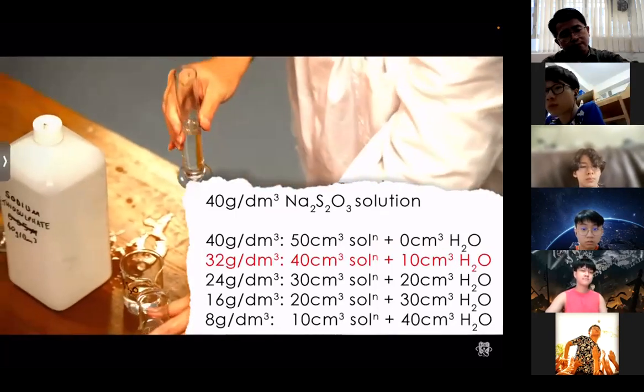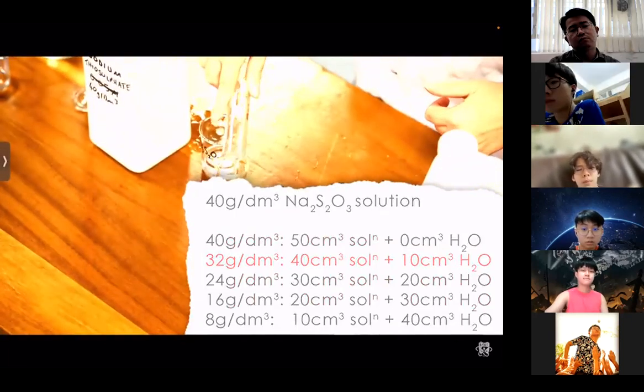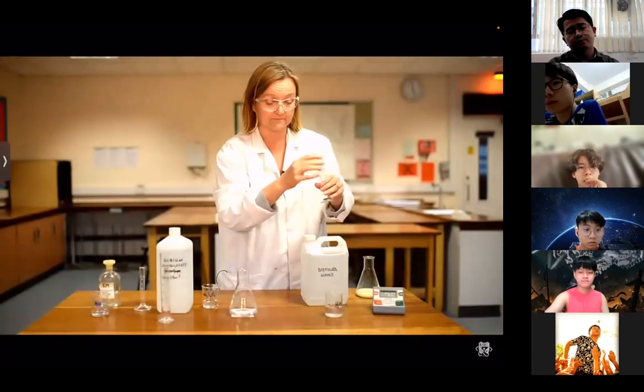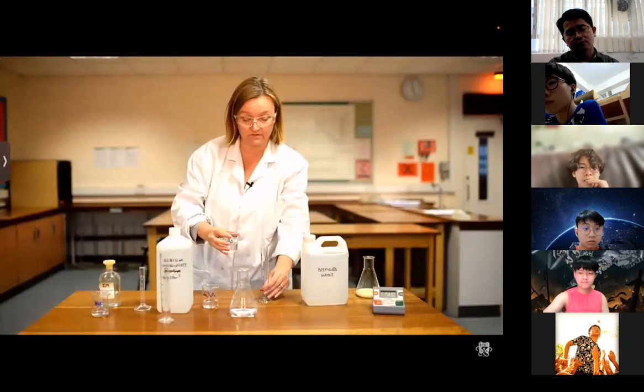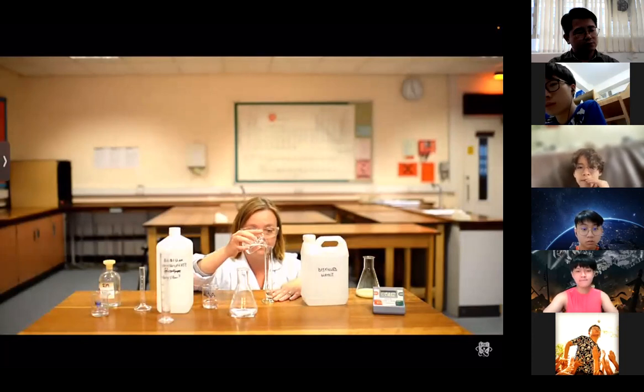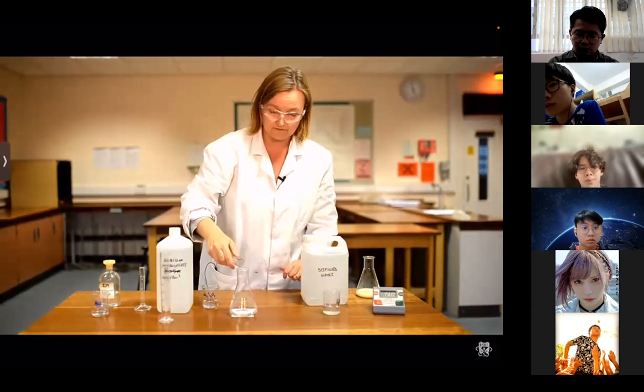I'm going to pour that into my flask. To dilute it, I'm going to add 10 centimetres cubed of the water, so keeping the volume constant at 50, but now reducing the number of sodium thiosulfate particles in that total volume.